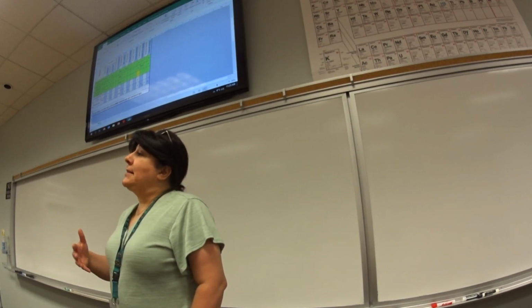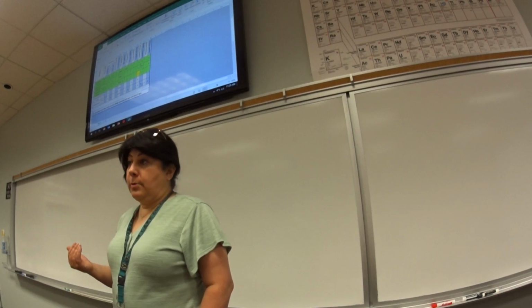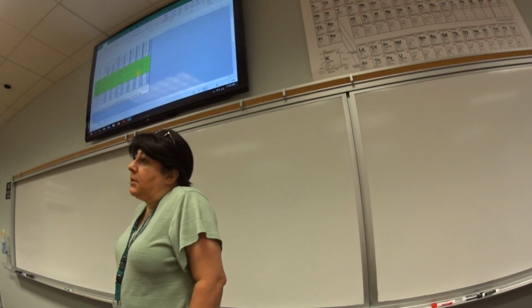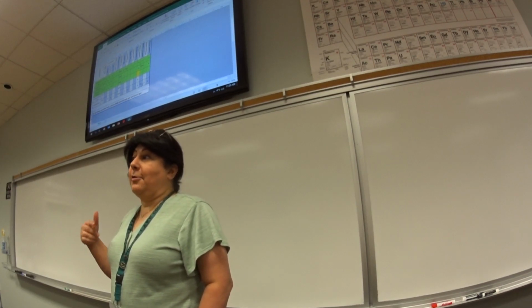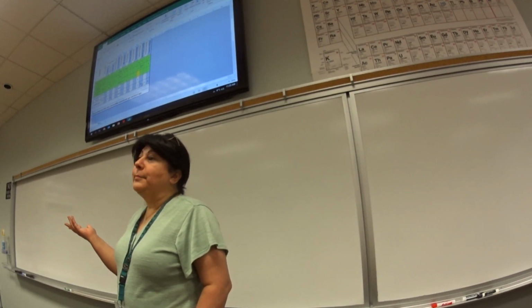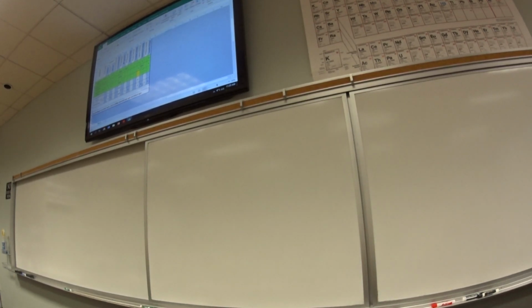So I usually say I want 3 or more tests, but for some of them, I totally understand. You cannot ask for more. For between those two, really, you can only ask for 2 tests. You can add blood to it too for the 3rd one, because remember, aureus did a beta, whereas epidermidis did an alpha for us. So you can again do that. So you come and ask for those, and I will have those ready for you next Monday.